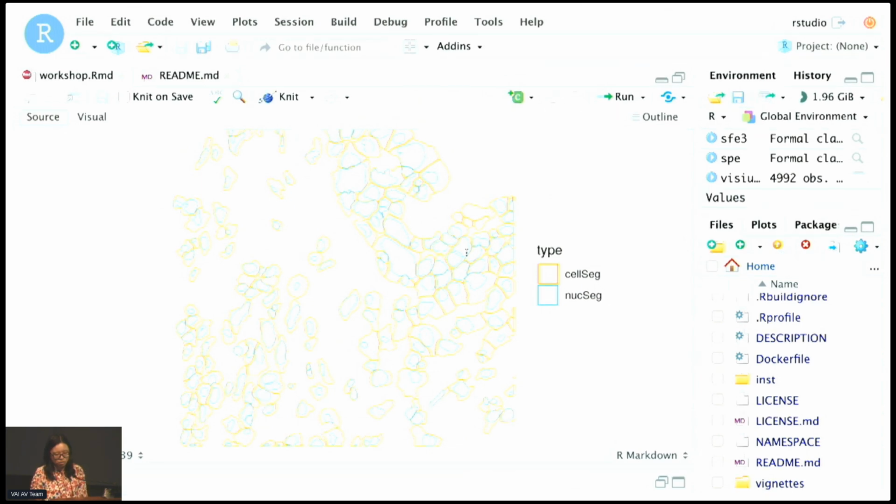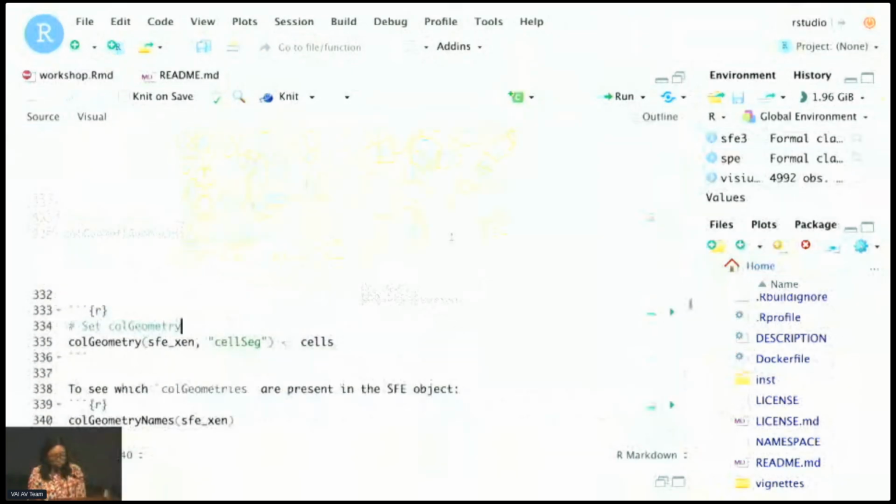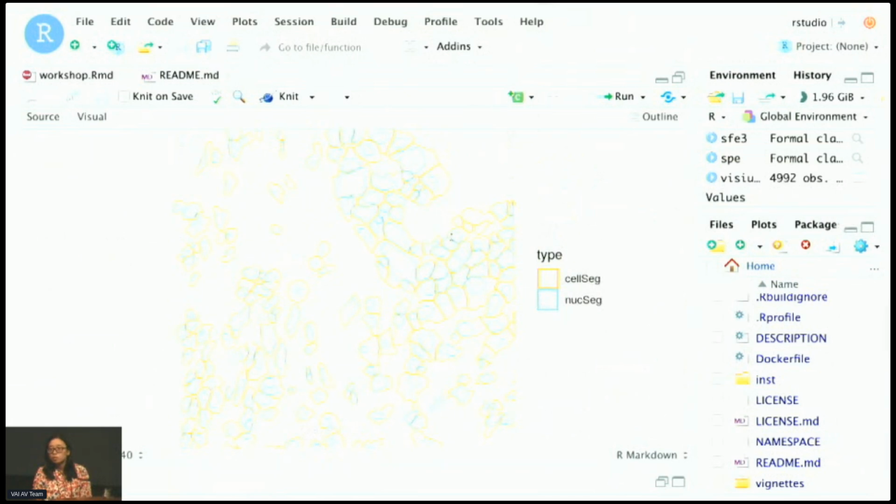I have a quick question about the plotting functionality. Sometimes when I'm plotting these single cell or Visium data, the cell boundary or the Visium spot boundary could create an illusion, meaning it creates a shade by the color plotted on it. Do you have some specific tips on the visualization? What do you mean by shade?